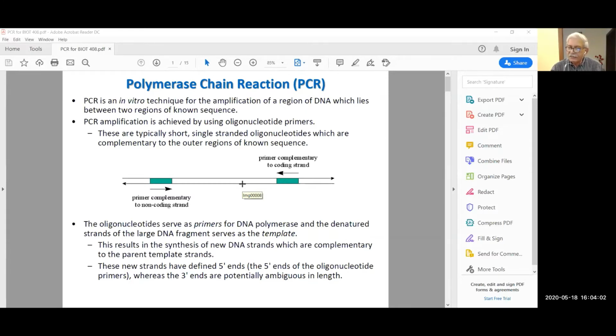Because whenever it is single-stranded DNA or single-stranded RNA, it gets into a secondary structure formation. And you need to open that secondary structure by heat denaturation. So heat denaturation is always required, whether it is a single-stranded DNA or a double-stranded.